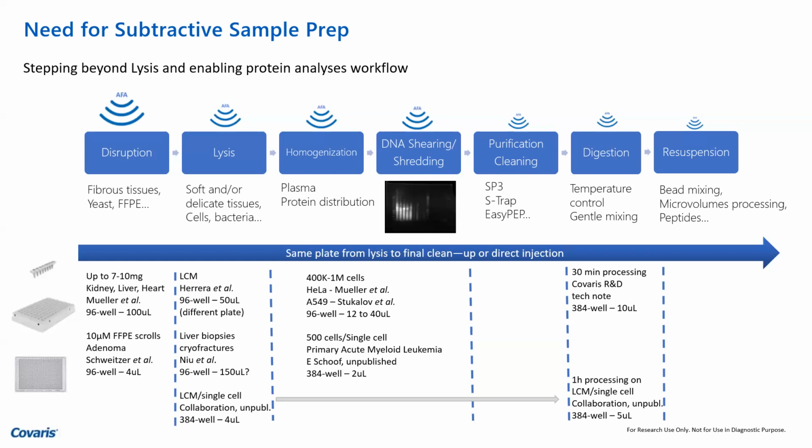Now the problem is, when you have a tissue, you disrupt it, very good. You get your proteins out. What do you do with it? Your first level of proteins is all that IgG, albumin, which are abundant proteins. By the way, clandestine information, they are not needed in terms of your research. You are not interested most of the time in looking at the IgG or the albumins. They're the most abundant, as Murphy's law goes, right? Whatever we look for is not available in abundance. We are looking for those trace protein biomarkers that are going to tell us the course of a disease.